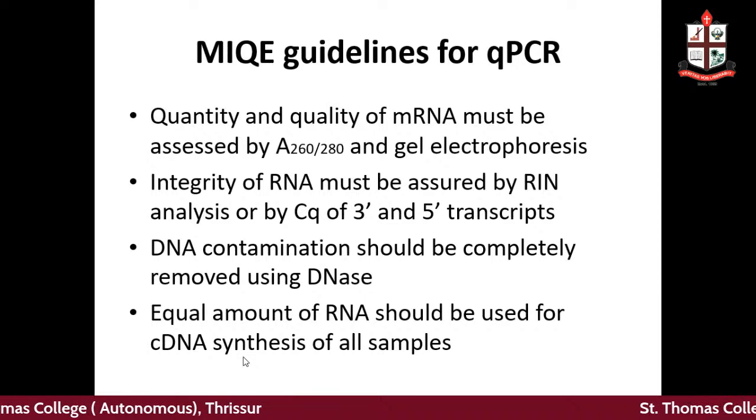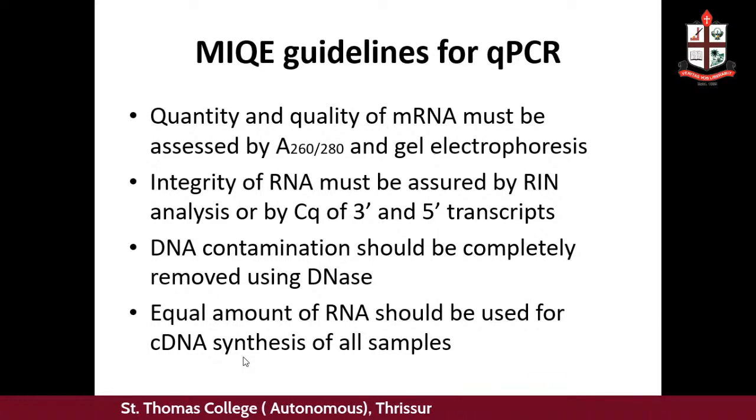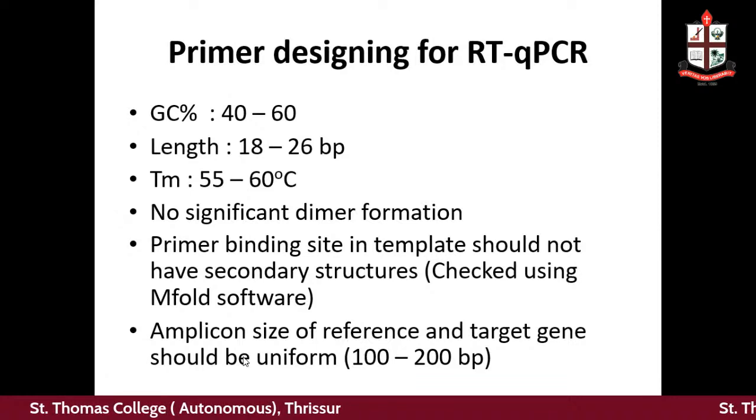It will not bind to DNA, it will be binding only to your cDNA coming from the mRNA. So that's another way of avoiding amplicons from your genomic DNA. Then when you do cDNA synthesis, you have to take equal amount of RNA. That's very important. Then when you design primer, what all things you have to take care.